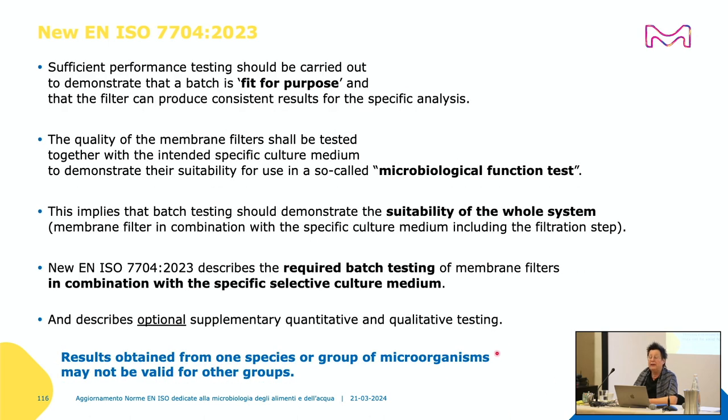It has been shown that some combinations of batches of membrane filters with batches of culture media do not work very well. That was the reason that ISO 7704 now describes performance testing which shows that the combination is fit for purpose. It's very important. It's a new way, really, to test the combination in a so-called microbiological function test.